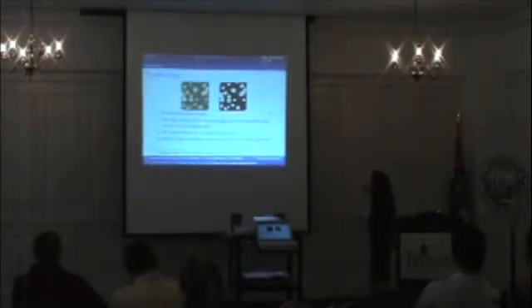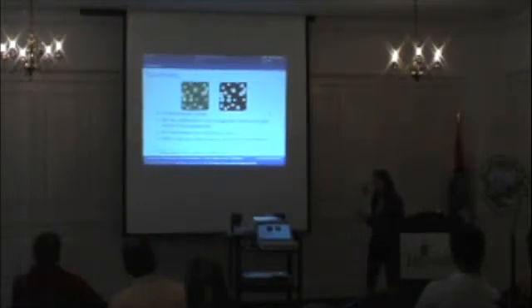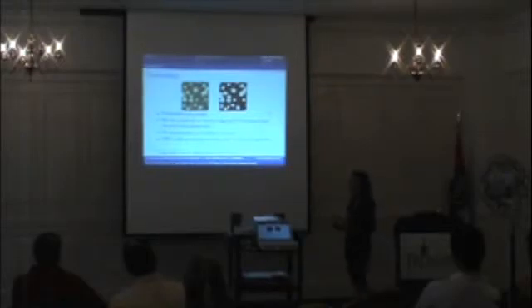No sweat there. The thresholding, as you can kind of see here, is not very effective for noisy images and just generally not clean images. The images we have are going to be real data. So for example, up here, you can see there's this light spot here, and you can't really tell if that's data or if it's in the background, just lighting junk, and clearly this threshold value defines it as not important. So is it a good thing? Is it a bad thing? It's probably not okay to just let that go.